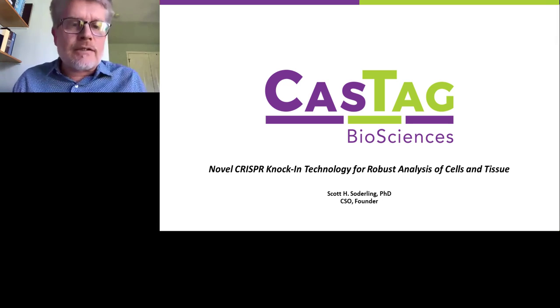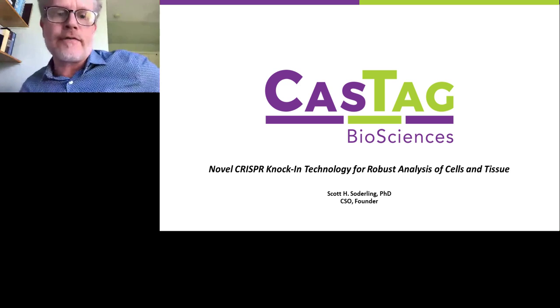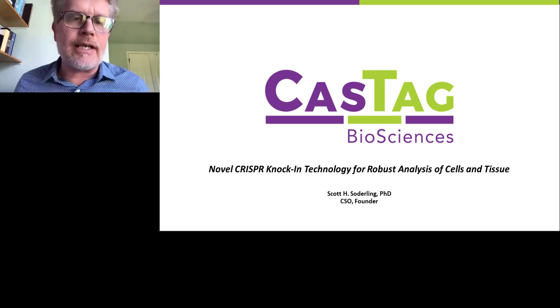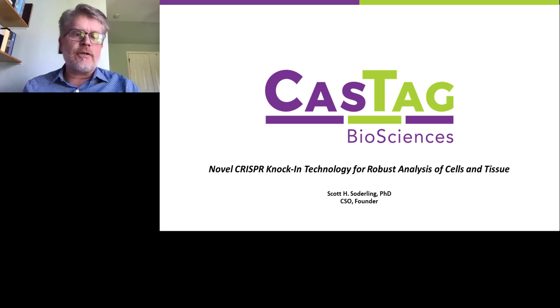My name is Scott Soderling, and I'm the CSO and founder of CasTag Biosciences. I also have a research laboratory at Duke University. So what I'm going to talk to you about today is a novel CRISPR knock-in technology for the robust analysis of cells and cells within tissues.